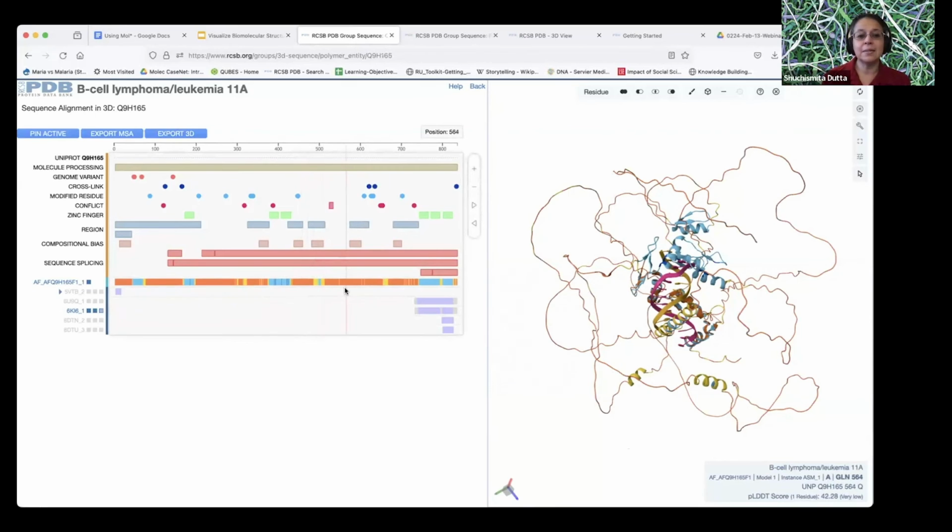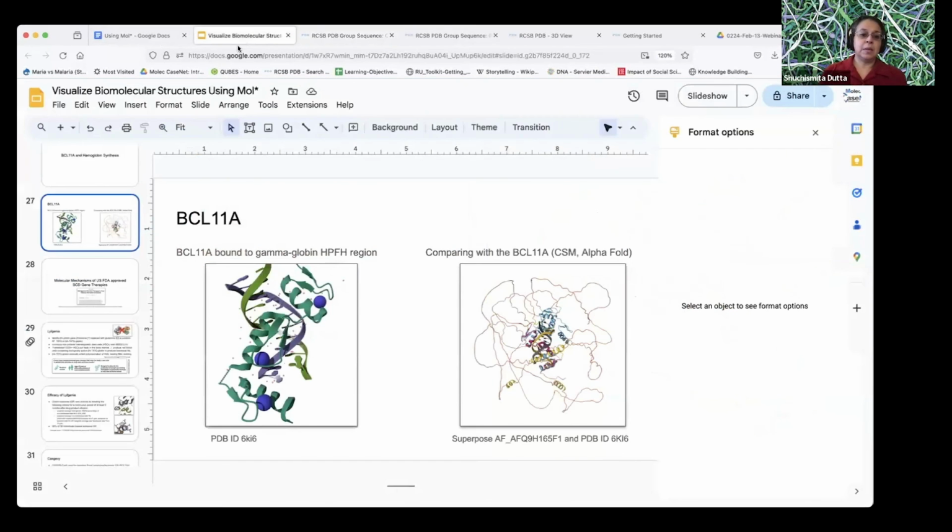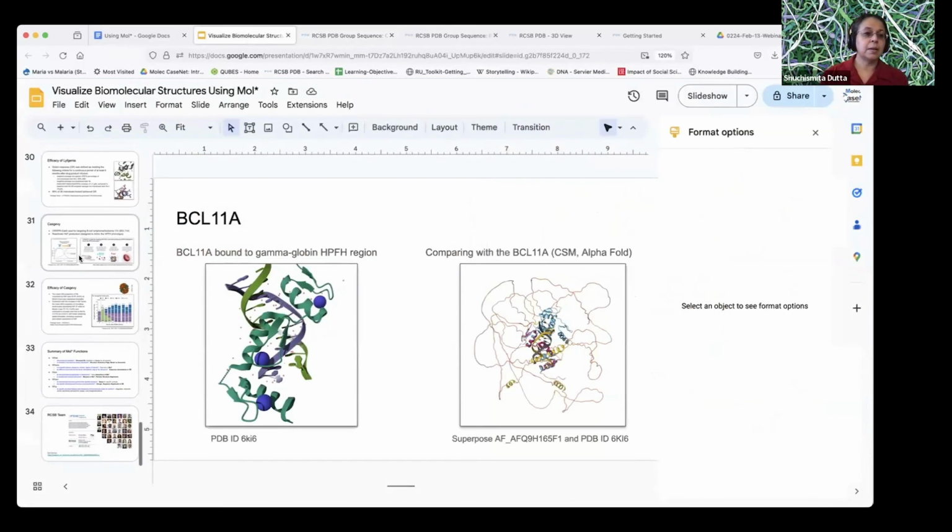And these large loopy parts, notice they are all colored in orange, while the parts that are more ordered are colored in blue. And this is where we have more information, more data, and so I wanted to showcase that just by clicking a few buttons, you can display multiple structures. I can display other structures also, and so on and so forth. Okay, so now to try and wrap it up.